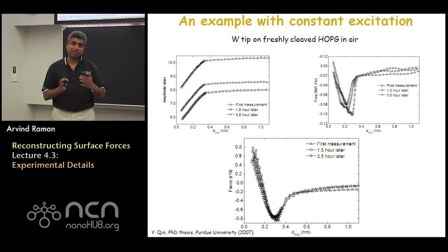Now, as I said, we've discussed in this class just one such probe. As far as normal AFM cantilevers are concerned, the methods for doing them have already been discussed before, and we will not be discussing those special needs any more in this particular part of the class. I do want to emphasize that a key issue in frequency modulated AFM is the hardware and electronics. We will not have too much time to go into the hardware and electronics, but the appendix has more information on some more details of phase lock loops and feedback loops that are used in FM AFM for those of you who are interested to pursue such a line of investigation.